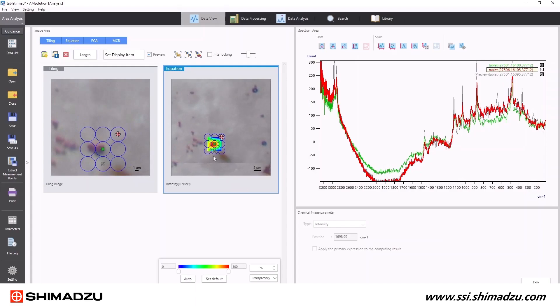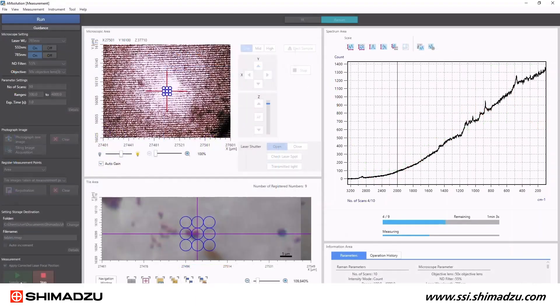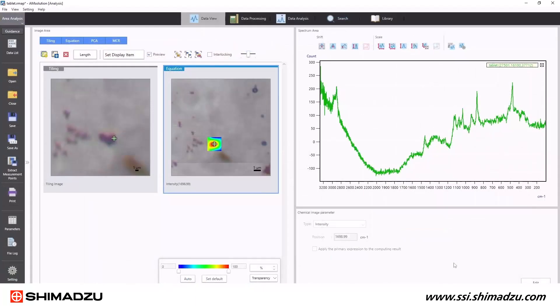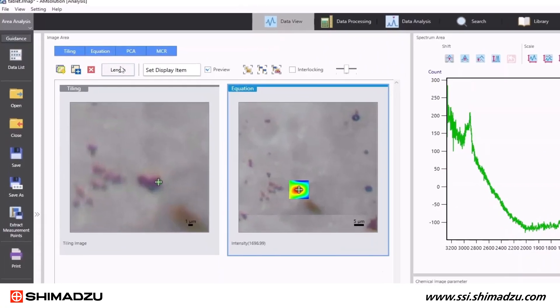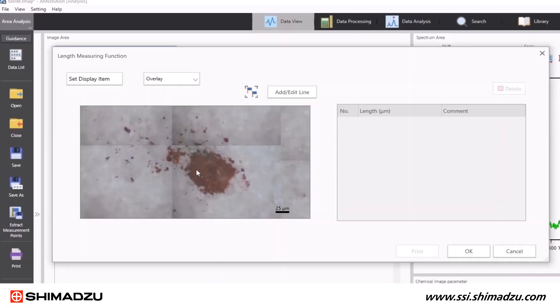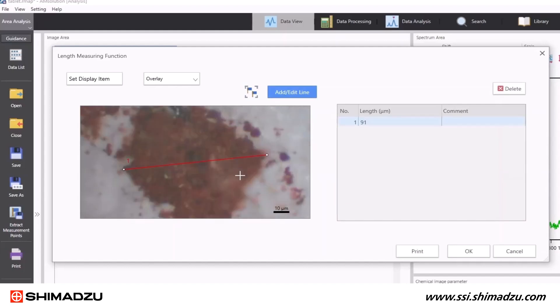One last feature to highlight is the length measurement function. When looking at your data in the post-processing mode, clicking on the length button will allow you to measure individual features in microns, which would be useful for microplastics and other small particles.